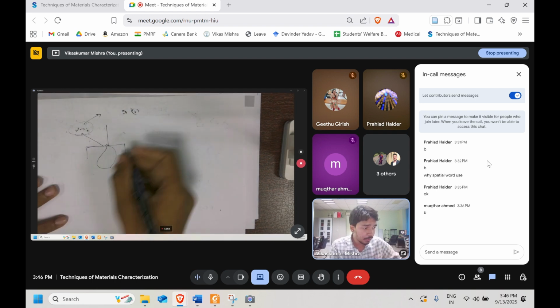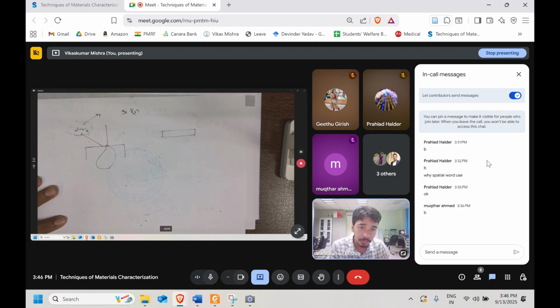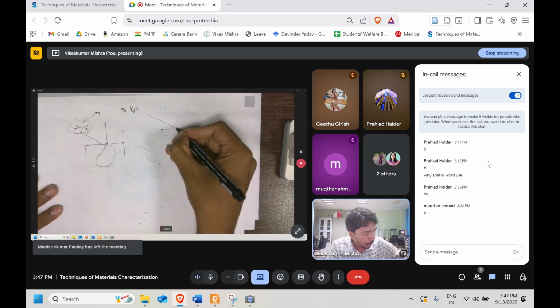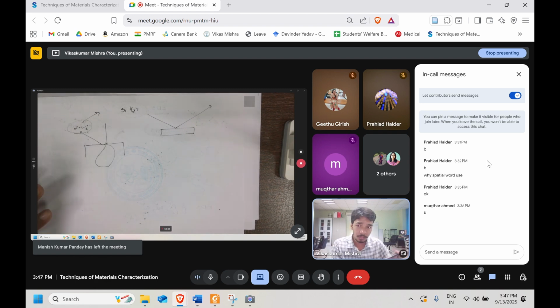While when we are using this particular crystal in the WDS, with the phenomenon of diffraction, that noise cannot show. It will be only for a particular angle. That's why we are concerned with the particular angle. So since from the EDS you have a rough estimation of the list of elements that are present, now you will focus your detector at those particular angles. Corresponding to that angle, the diffraction will happen only from the particular X-ray that has been generated.